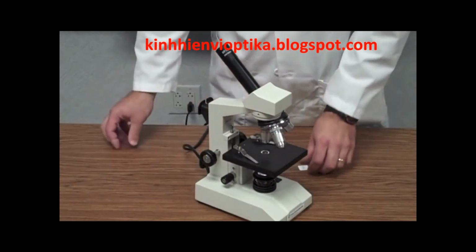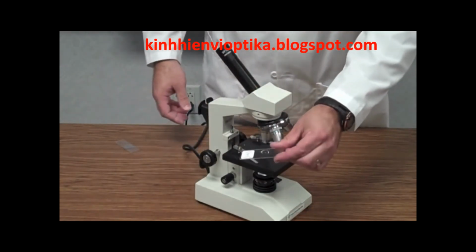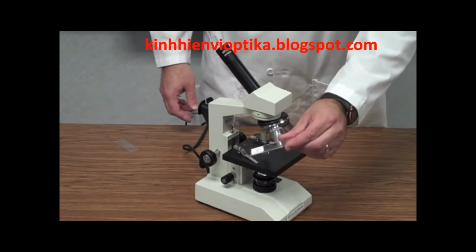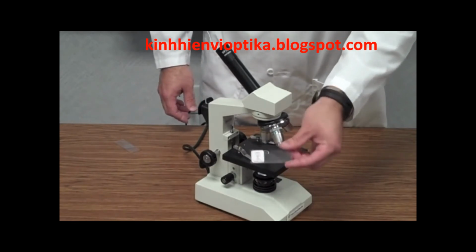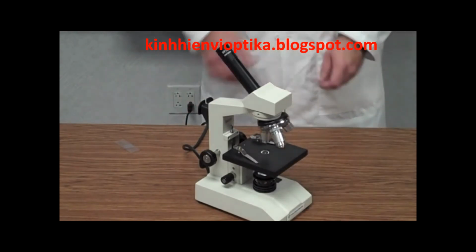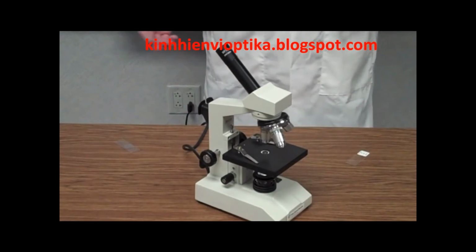Okay, we also have what's called prepared slides. This is a prepared slide. Okay, this particular prepared slide is of frog skin. So if you want to look at what frog skin looks like up close, you could look at this particular prepared slide. Okay. So now let's talk about the process, how we go about using the microscope and focusing the microscope and so forth.